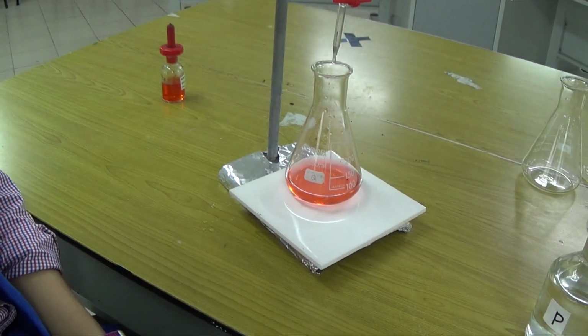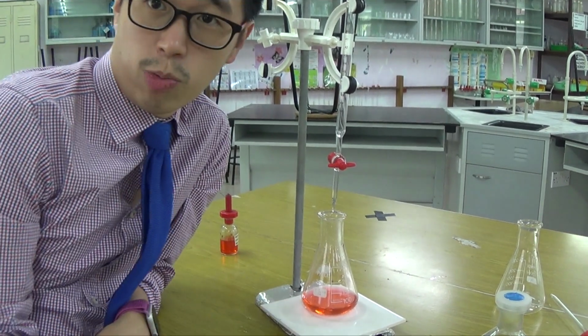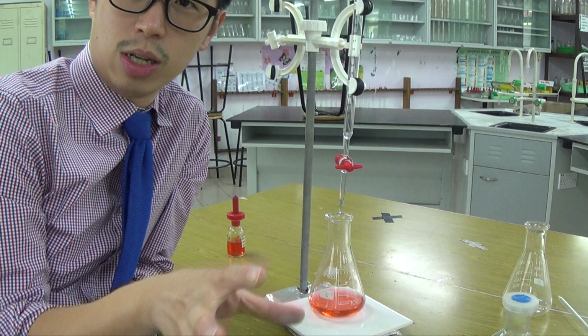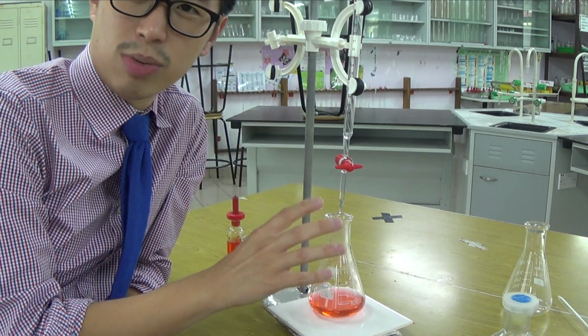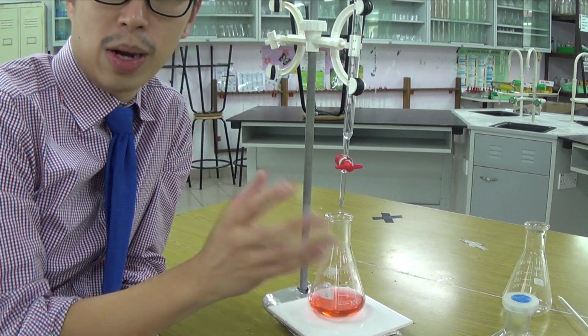And when that is in excess, we need to be aware of what volume we need later on in order to be exact. 23.7 is a rough titre. It was meant to be in excess. I wasn't careful there. From my second titration onwards, I must be very careful.